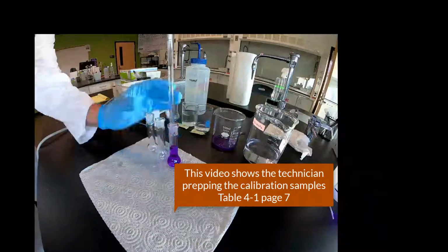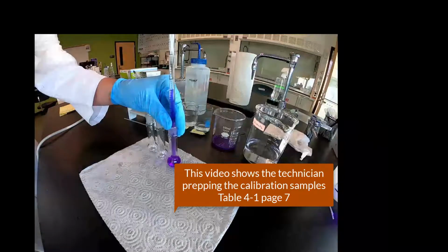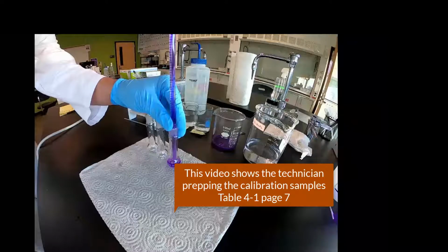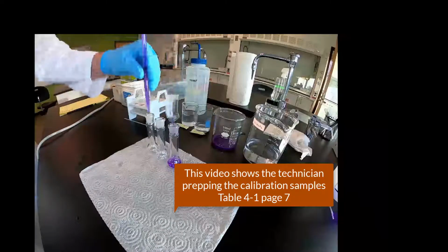So this pipette's already been rinsed. Okay, so he's drawing it from that first flask he made, but you could just draw it from the mother solution. Not wasting samples, so that's good. But anyway, that is not necessarily the technique. You could just drop from the mother solution directly. But either way, this is fine.